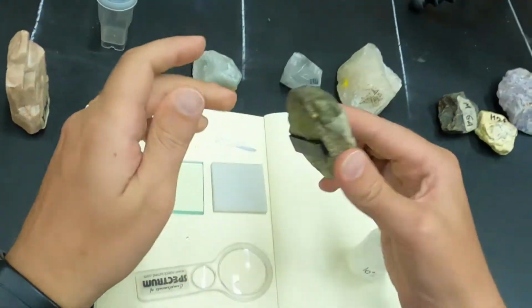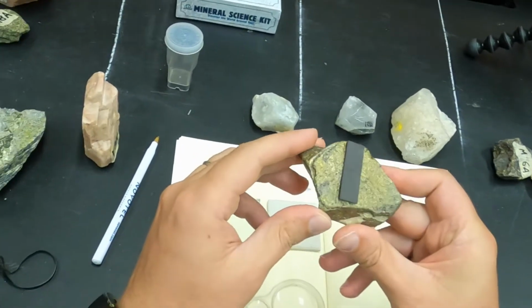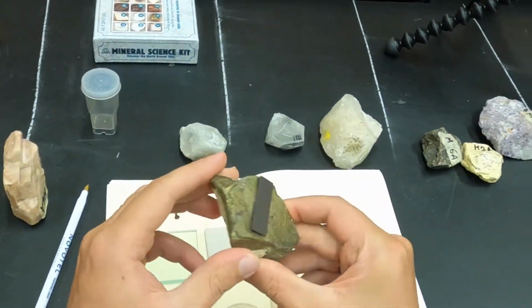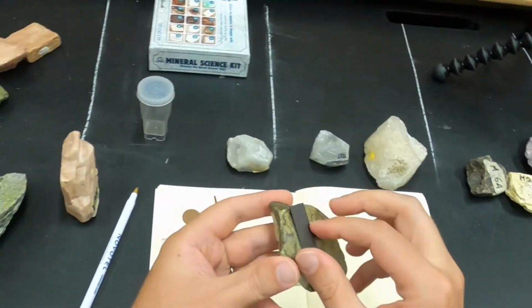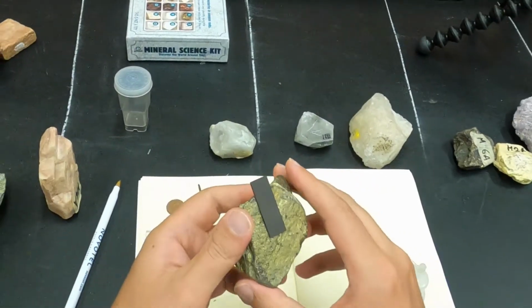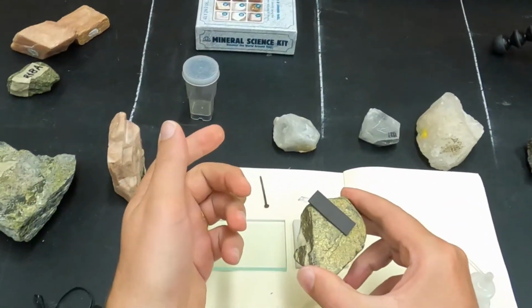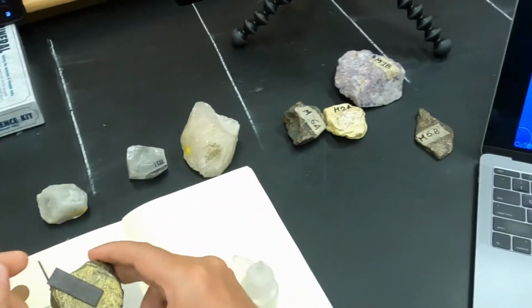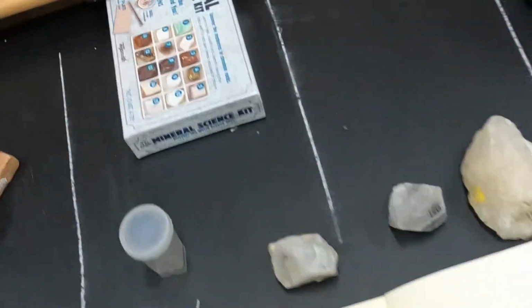So this example likely contains pyrrhotite. So if you have pyrrhotite veins, they will be magnetic. Okay, so you have to record this information, so be able to recognize weakly magnetic like this example here, or highly magnetic like magnetite. We can look at another specimen, I think.